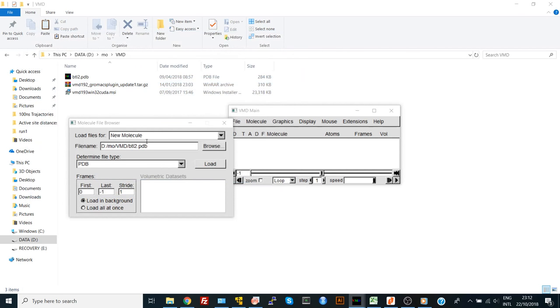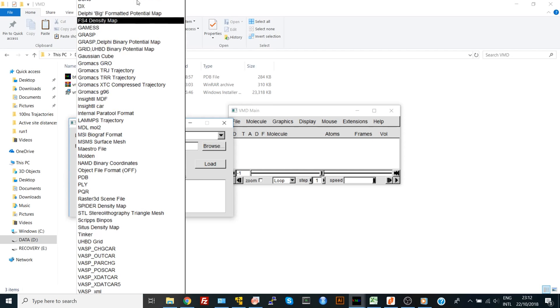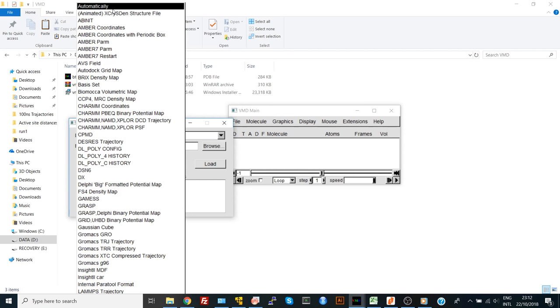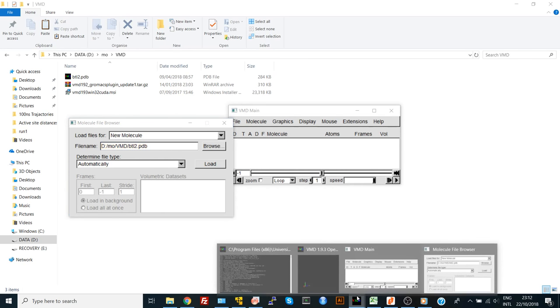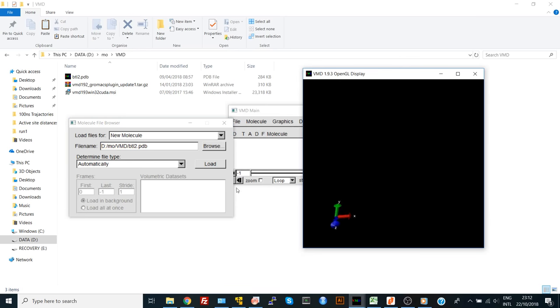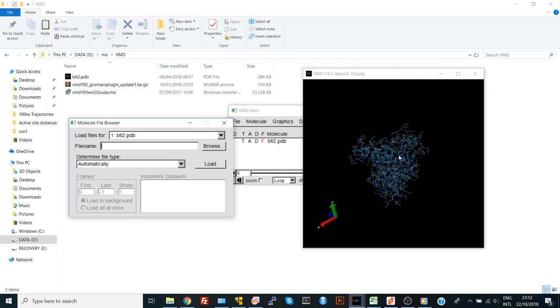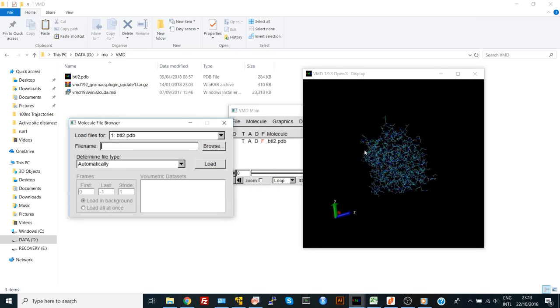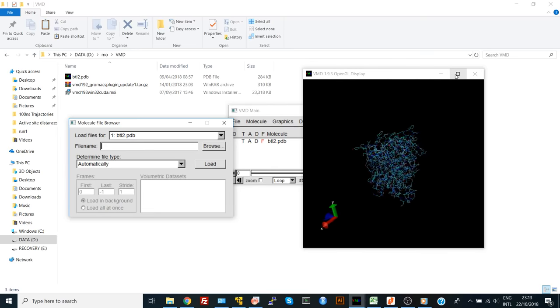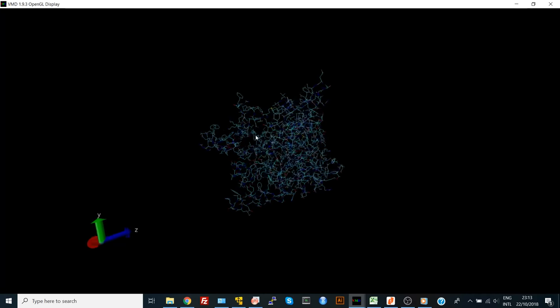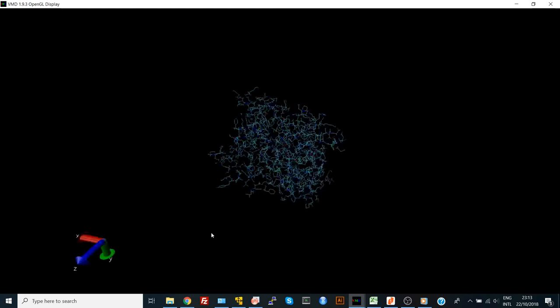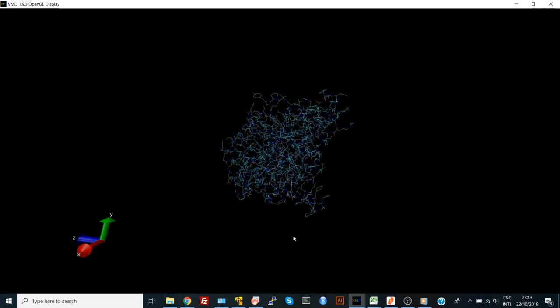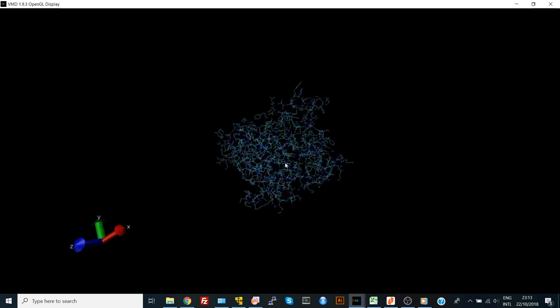You say load, but before we load, note that if you keep it on automatic, VMD will understand that this is a PDB structure. When you load, you will start seeing your protein moving nicely, and then you can start your different calculations or graphical representations.